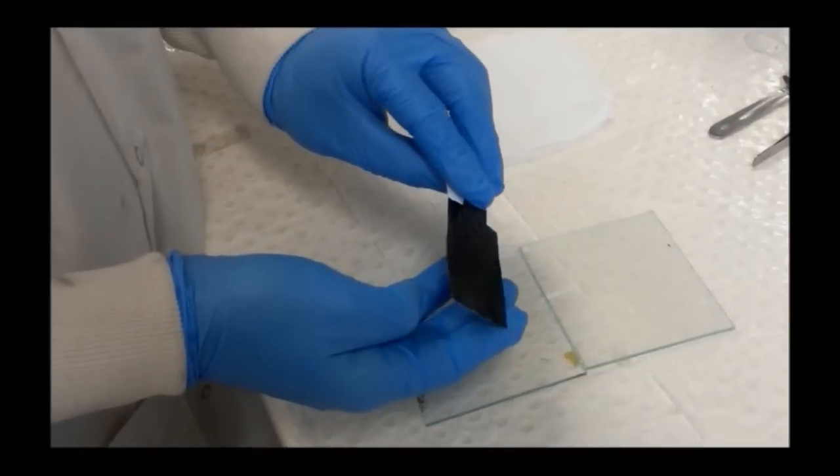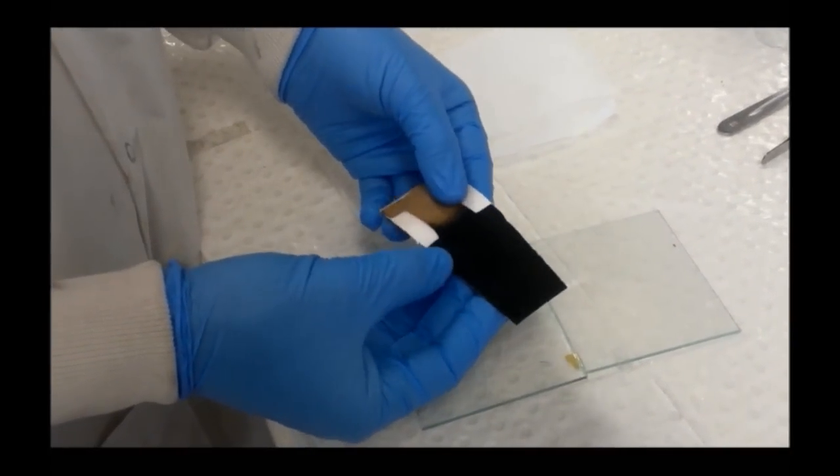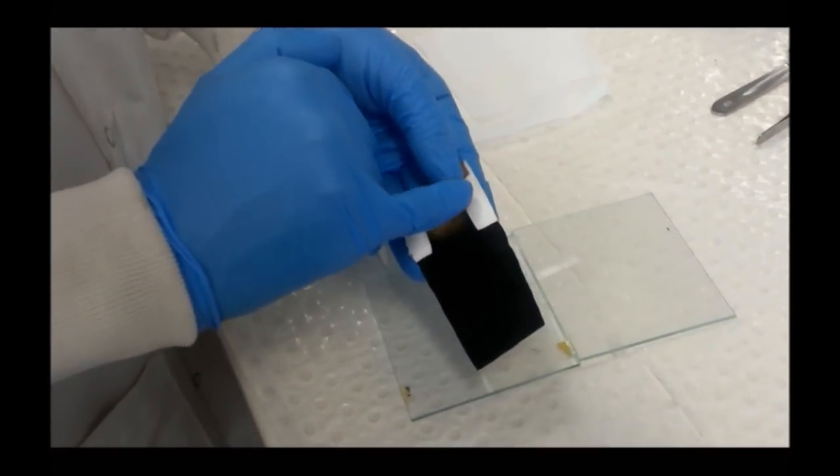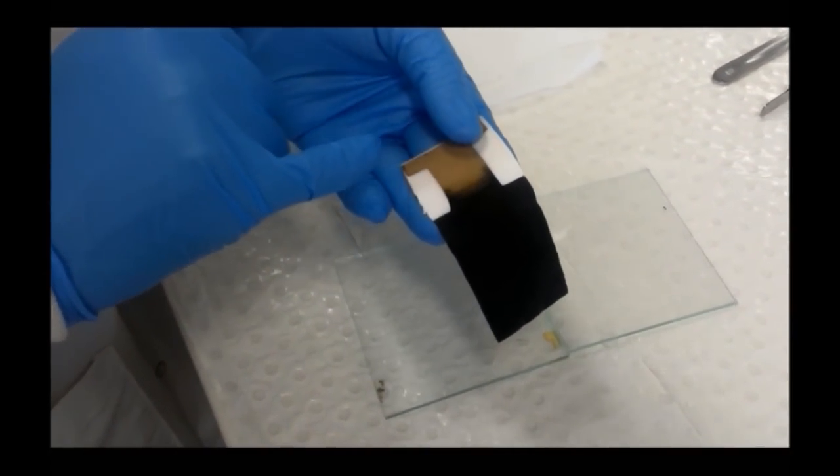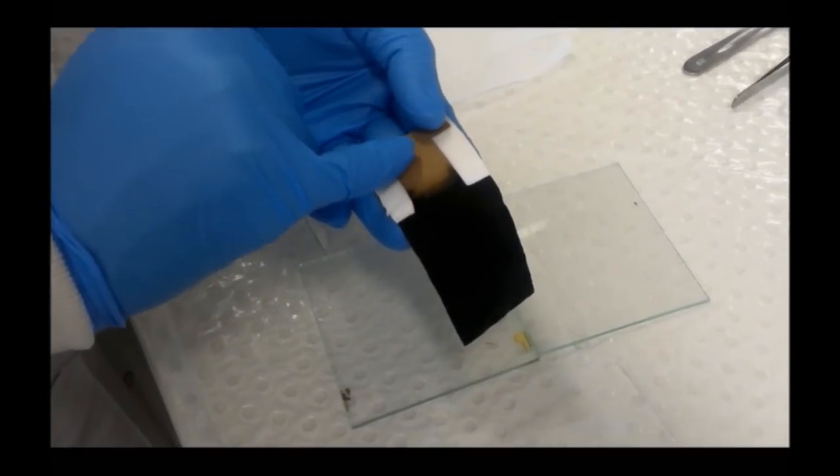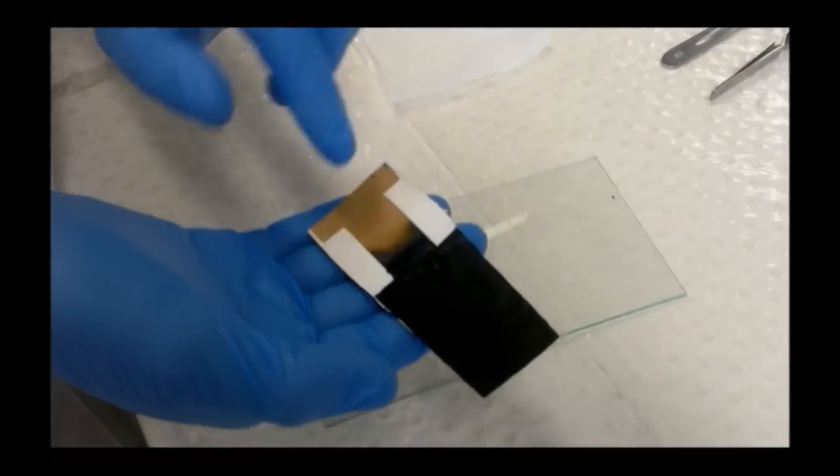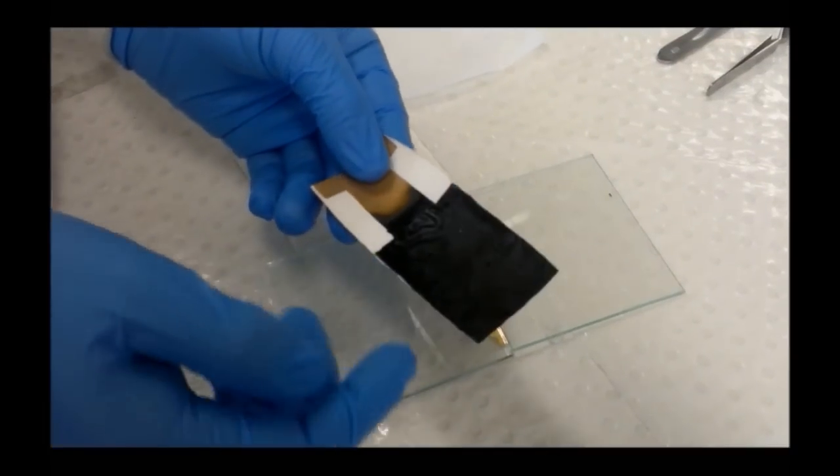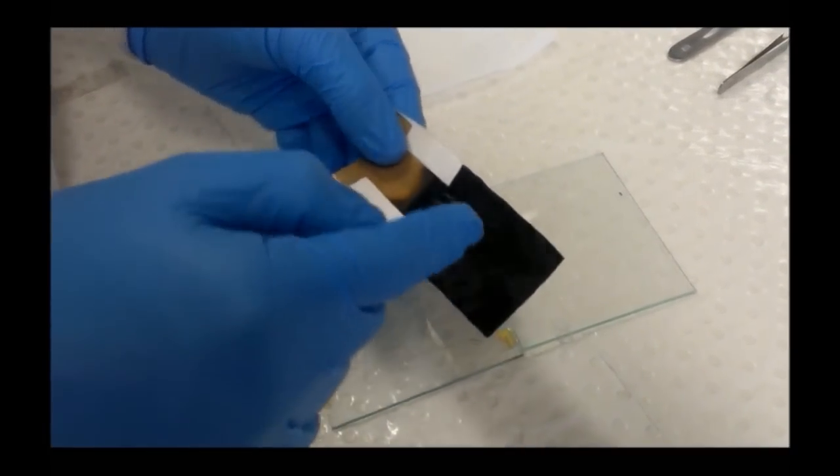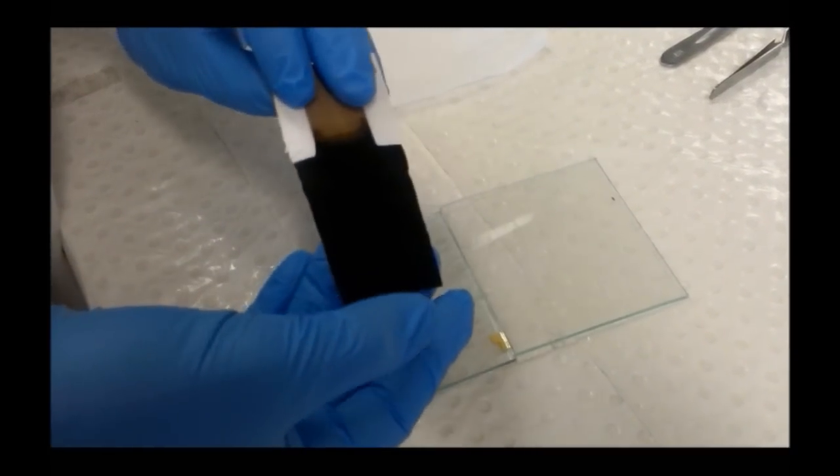This is one of our polypyrrole bender actuator samples as we make it. The white area is polyvinylidene fluoride filter membrane, coated in gold on both sides. The gold acts as an electrode for deposition of polypyrrole, which is the black layer.